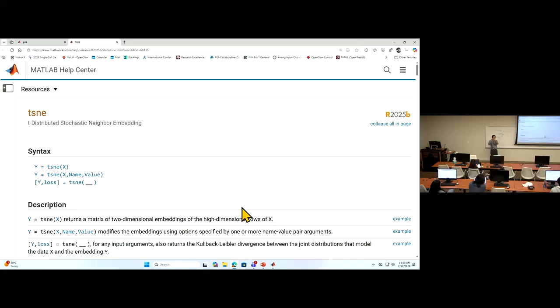Statistically, the probability of the neighborhood will be kept. That's why this will be a reduced dimension space, and you will still have the same number of samples. Your data point numbers will be the same. So remember also this input will be sample by variable. So if you have a gene by cell matrix, you need to transpose before sending into here.